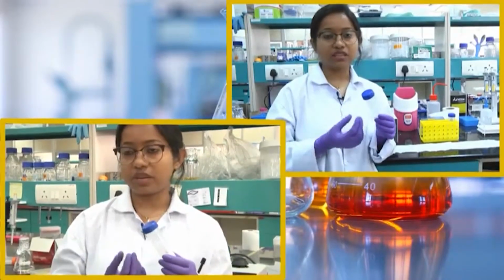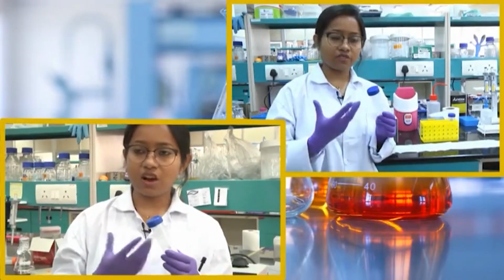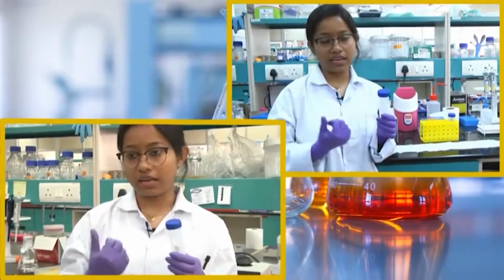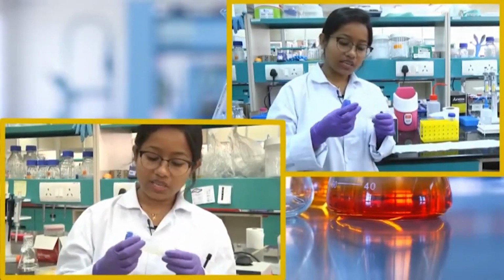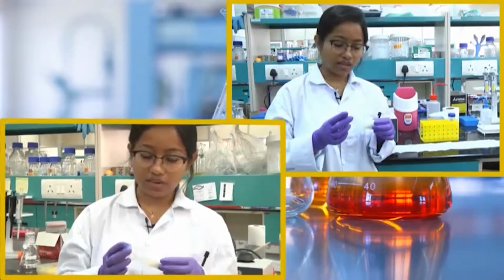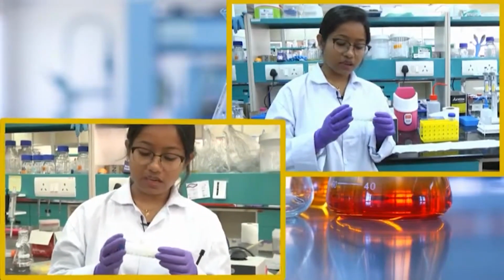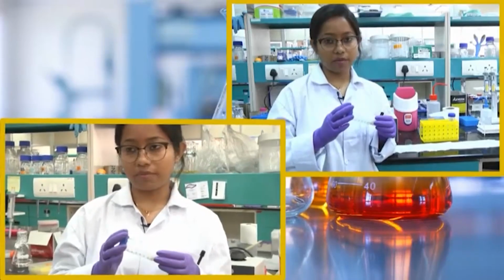If you are using fungus, you can use a French press or a different homogenizer, or if you are using some kind of tissue system, you can use liquid nitrogen or an electric blender system. Here we are using an ultrasonic sonicator machine, which will degrade the cellular membranes and the DNA and RNA.